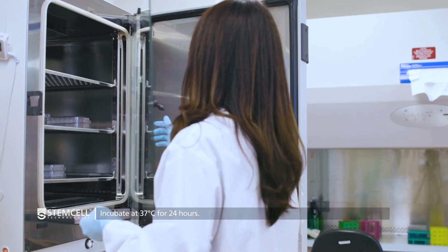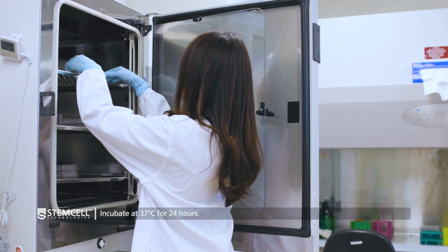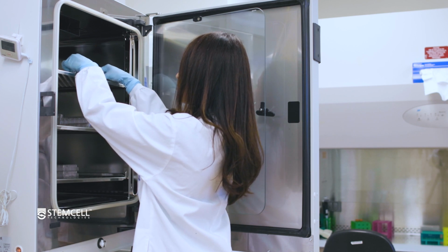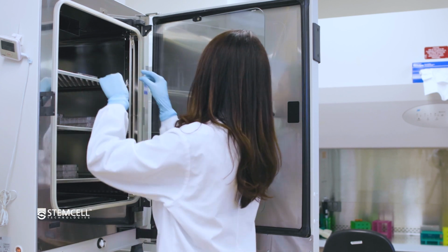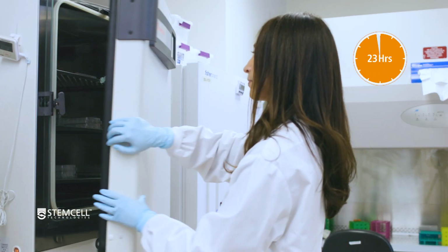Then place the plate in a 37 degrees Celsius incubator with a 5% CO2 and 95% humidity atmosphere, and move the plate in several quick, short, back and forth, and side-to-side motions to distribute the cell aggregates. Do not disturb the plate for 24 hours.